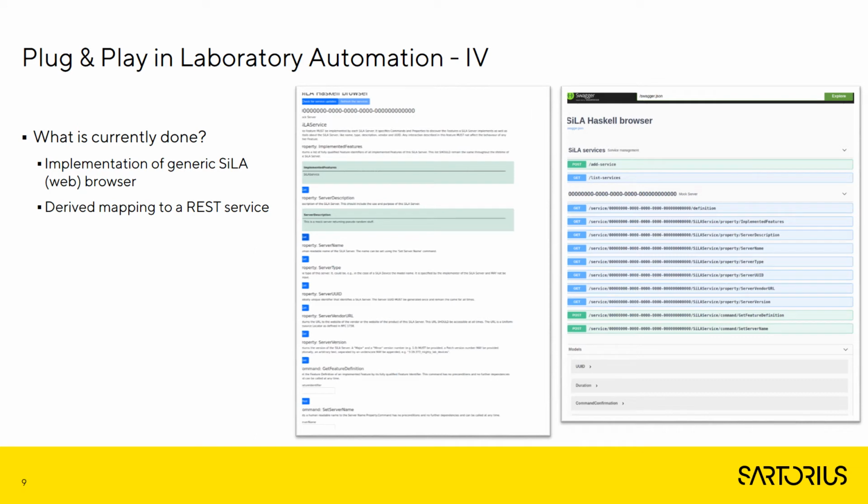On top of these functionalities, we have set up a generic SiLA 2 browser, which is able to show and trigger all devices and their corresponding features. This further includes all available information present in the SiLA 2 feature definition, such as maximum or minimum values. Furthermore, all feature entries, including properties and commands, are automatically mapped to REST endpoints, which allows further adoption into a variety of platforms, such as standard business intelligence tools. A next step would also include the implementation of a data standard to reach true end-to-end integration.